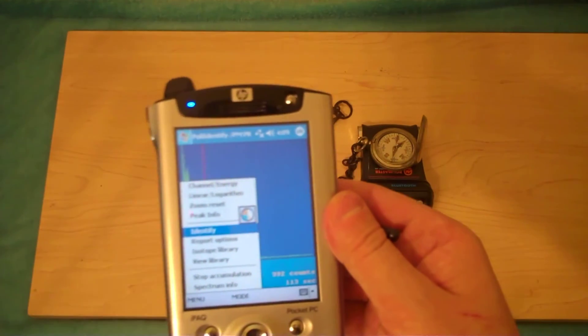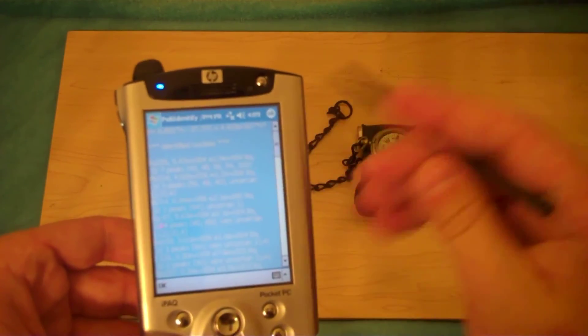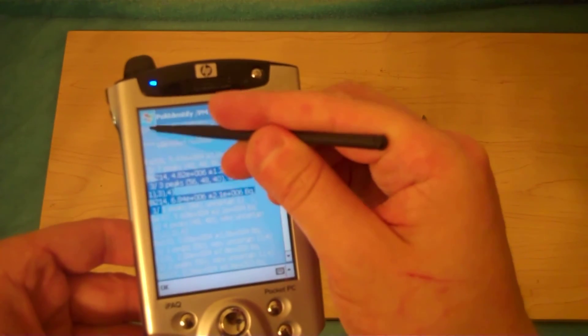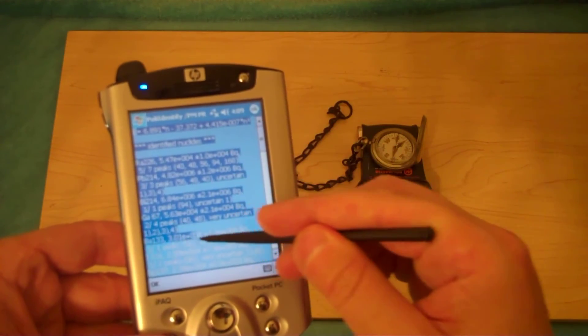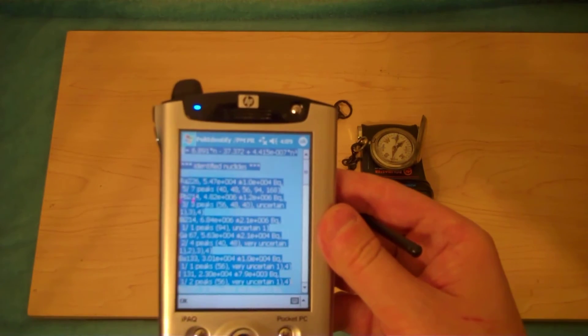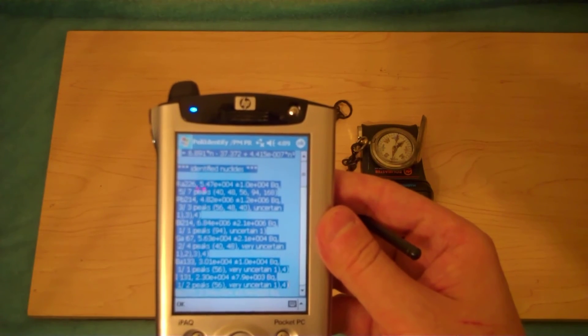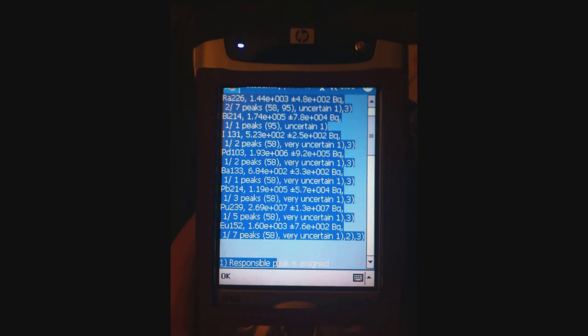We'll do an identify. As you can see, large amounts of things are identified, but only at the very top do you see things identified directly. A lot of the other stuff below says 'uncertain' or 'very uncertain,' and it picks up all kinds of things like plutonium which aren't there. It's kind of hard to see on the old-fashioned LCD screen.